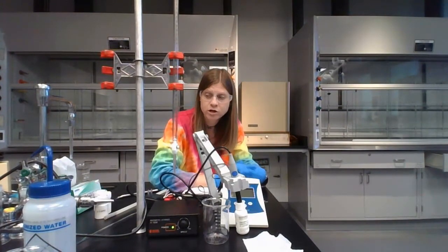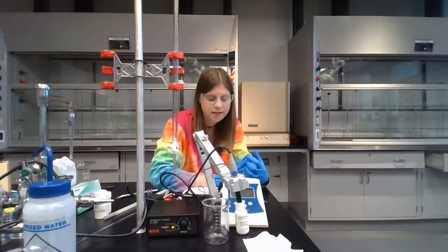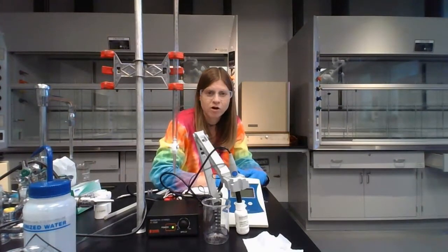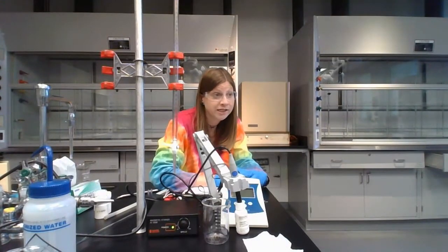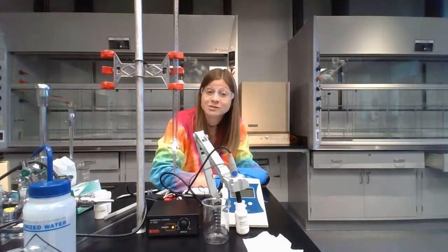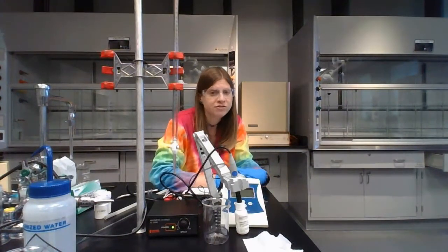The two pieces of glassware you are not washing are the 25 milliliter pipette and the burette. Those have to be placed in special containers. When you're preparing for this lab, for your estimated volume of sodium hydroxide, you don't really know how much sodium hydroxide you're going to need. And I can't even tell you because it's going to depend on what your unknown number is. So just to be safe, assume that you need 50 milliliters of sodium hydroxide for each trial.